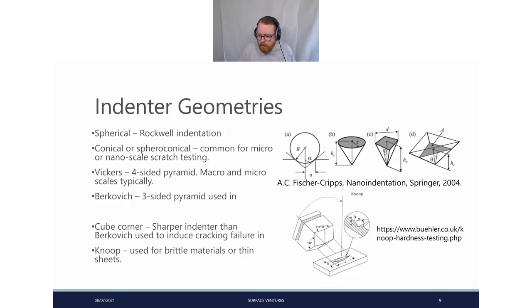Quick comment there. Ra can be the same for different surface textures, which can result in misinterpretation of results with just the Ra values. So in which case, what are the other roughness parameters that need to be considered for a coating of 5 microns thick?